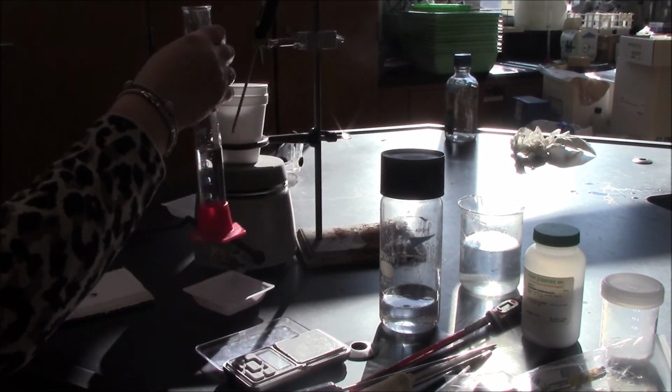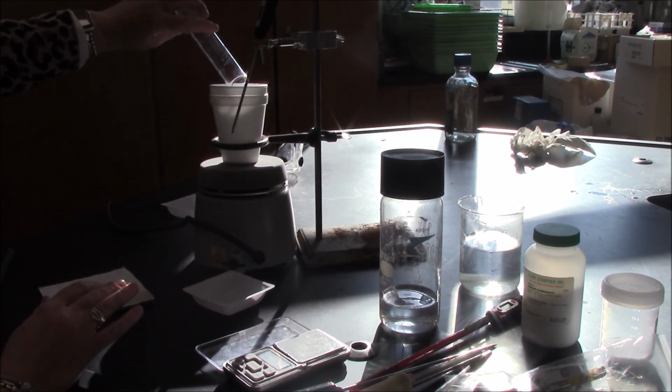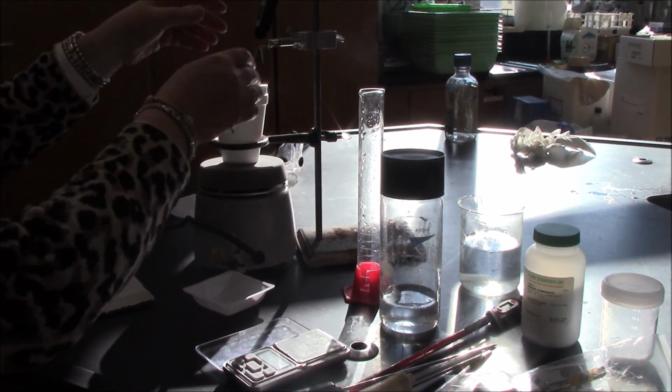All right, 50 milliliters of water into my calorimeter. I'll set it to stir.